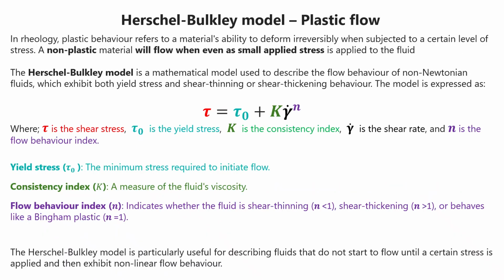The Herschel-Bulkley model is probably a more useful model. I've tried to remove this from this particular practical by making sure that the creams were pre-treated so that you didn't have any plastic element to them. However, what it does is give you this sense of how much force you actually have to apply to start some movement occurring, and this is done by what we call the yield stress figure. So it's the minimum amount of stress to initiate flow.